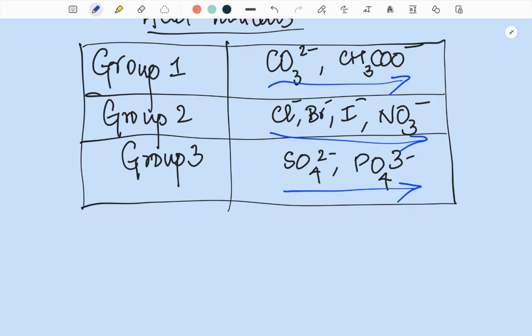Now, let's say there is chloride ion. Chloride ion may show a positive test for the ions which are coming after it, like it may show a positive test for the nitrate test, or a positive reaction for the sulfate systematic test. So, in order to eliminate the chances that the positive test could be because of chloride, we use a test in advance.